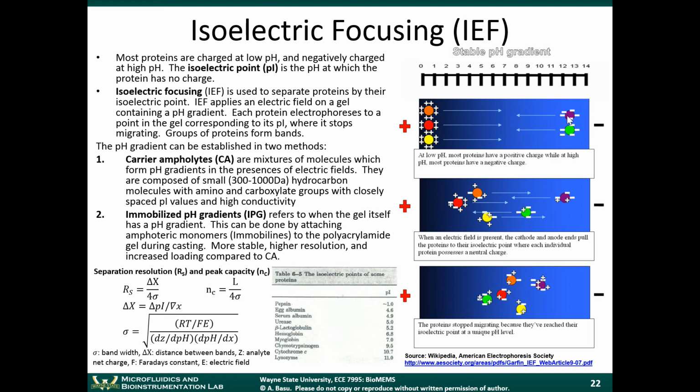Another analytical technique is isoelectric focusing. It's called IEF for short. You can see that in this class we're just rolling through, giving you an overview of the different analytical techniques. Half of what we're talking about is conventional technology, and half of it is going into the microscale implementations of these techniques. But having a broad overview will be helpful to you, because these types of analytical techniques are where the commercial applications of lab-on-a-chip systems are, at least right now.